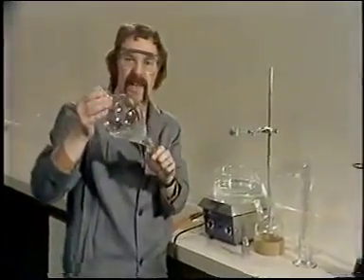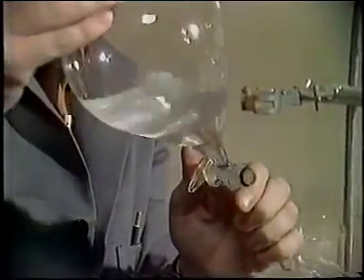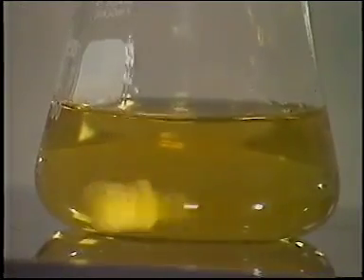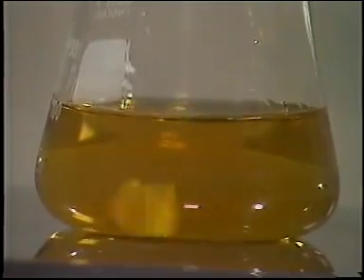And the organic layer, now containing our product, has only to be dried and evaporated to give us a crude sample of benzoic acid. This is a much more complicated reaction. No inorganics are involved here, just organic reagents and a solvent.